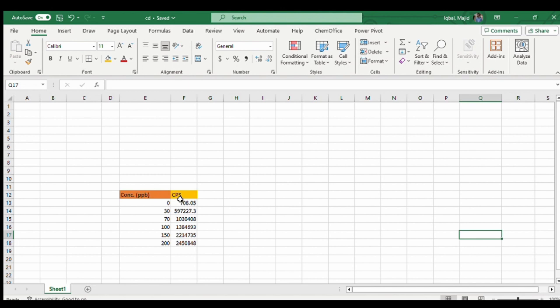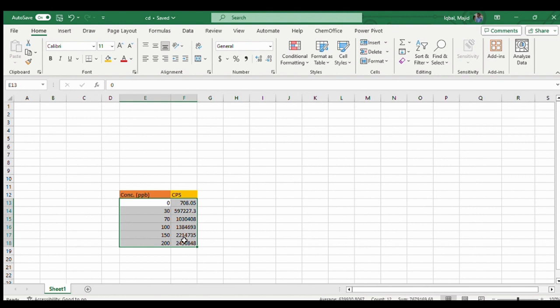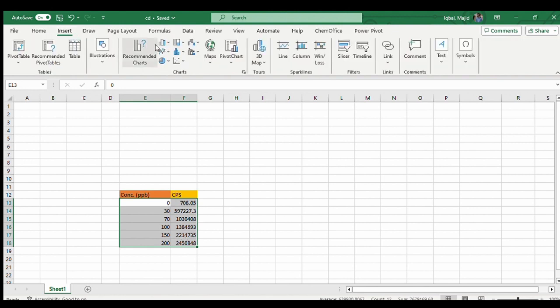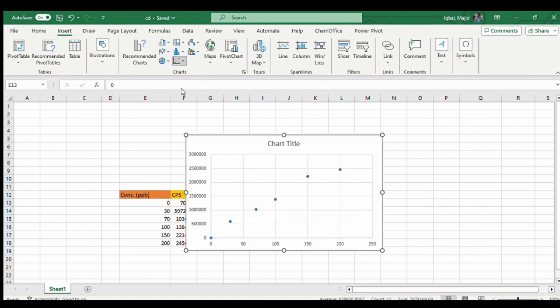First you have to select this data and then you have to go to Insert. You can see these different kinds of graphs. From here we have to select a scatter graph.